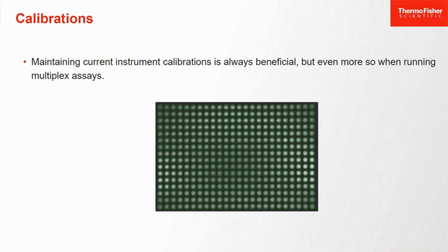I think this is a fairly obvious statement, but the more dyes you have in the multiplex, it's more important to maintain current instrument calibration. That's beneficial regardless, I would say, but even more so in a multiplex assay.